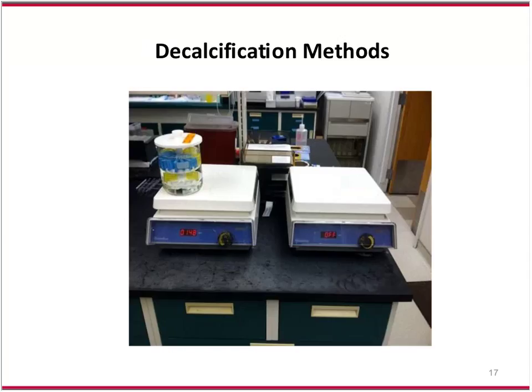Here's a picture of some of you may recognize these. These are old microwave processing vessels that are on the stir bars. We put our cassettes in the racks with our decalcifying solution and let them stir for generally about a week, 7 days for the hind limbs. We change our solution every 5 days. And it's very important with all of your solutions in histology, which you all know, that you change them regularly and keep them fresh.